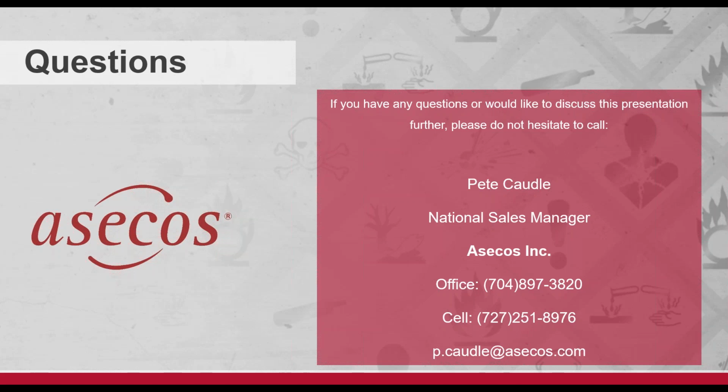Yeah, I would agree. Like I say, what I say would be a starting point, and I would hope with my design that I could do that. But if you've got to ventilate them according to the AHJ, I don't know if it's the same there. There's some counties that could be different to the adjacent counties. I can't even look at a city or a state in the U.S. It's typically just that AHJ, the code or fire marshal, plan reviewer, right?